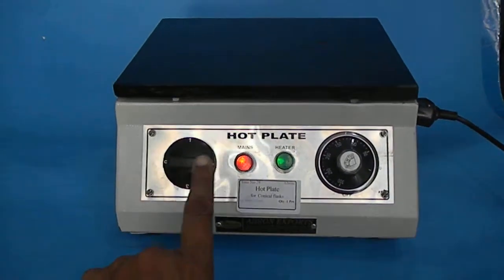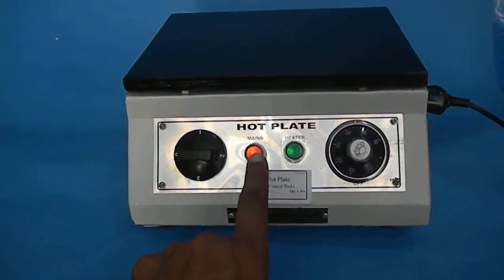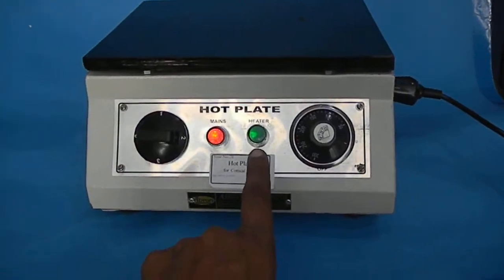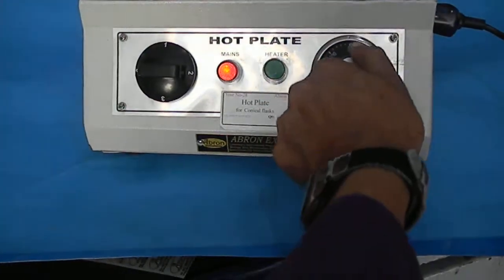This is Abron hot plate. We have a rotary switch with one, two, three positions. The main indicator means current is coming. This green light tells you the thermostat is working. This here is a thermostat energy regulator.